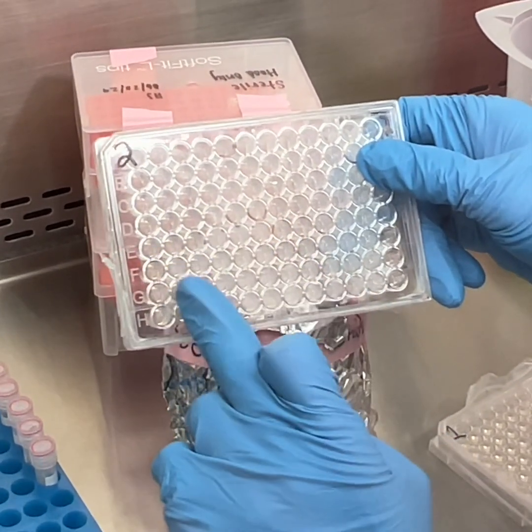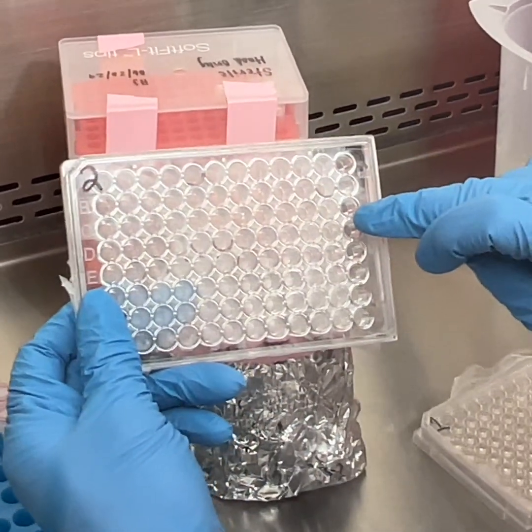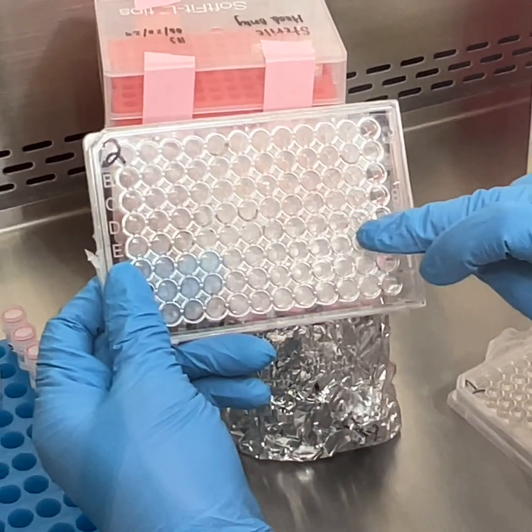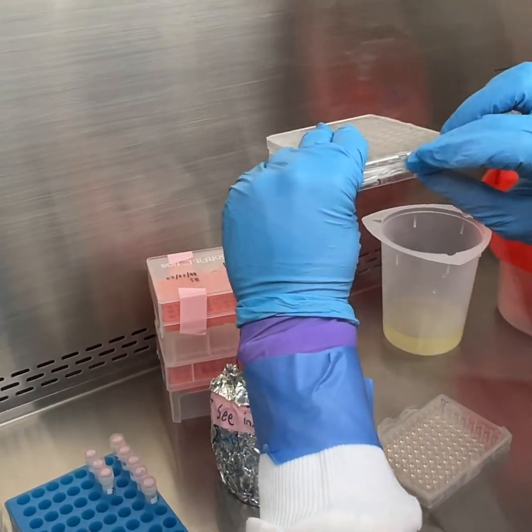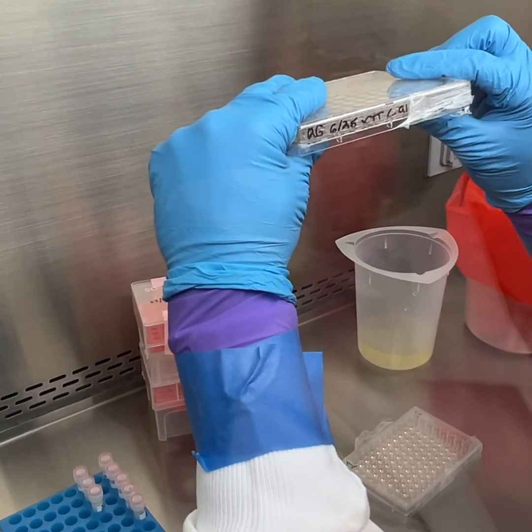there's some turbidity in these wells, whereas when you compare it to the negative controls, there's nothing in the negative controls. And so that's indicative of biofilm growth, however minimal. We might be able to see the three-dimensional architecture. No, you can't. It's kind of hard to see.